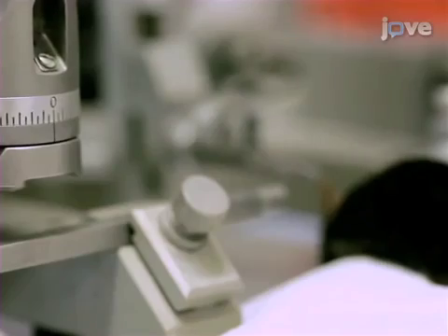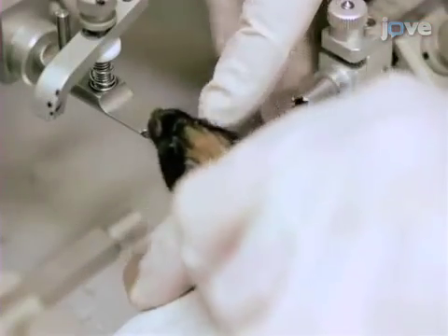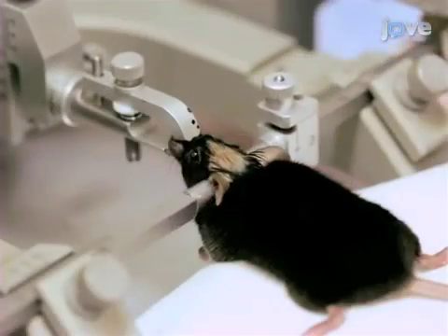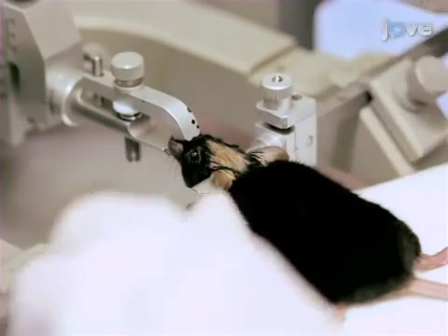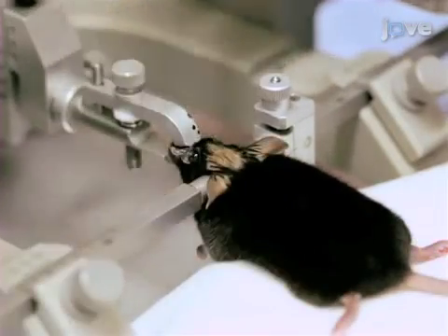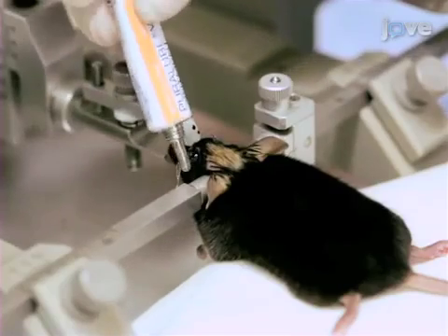Zero the tooth bar and ear bar scales and set the mouse's teeth in the tooth bar. Screw in the muzzle and the ear bars. If any wiggling or whisker movement is noted, administer a booster dose of ketamine xylazine cocktail. Then lubricate the eyes to prevent them from drying.